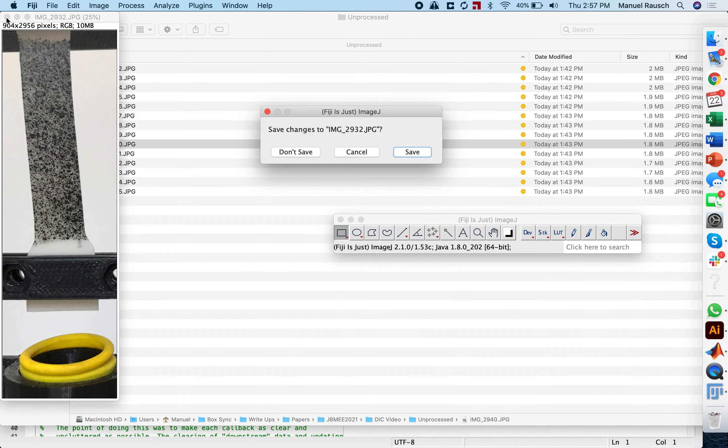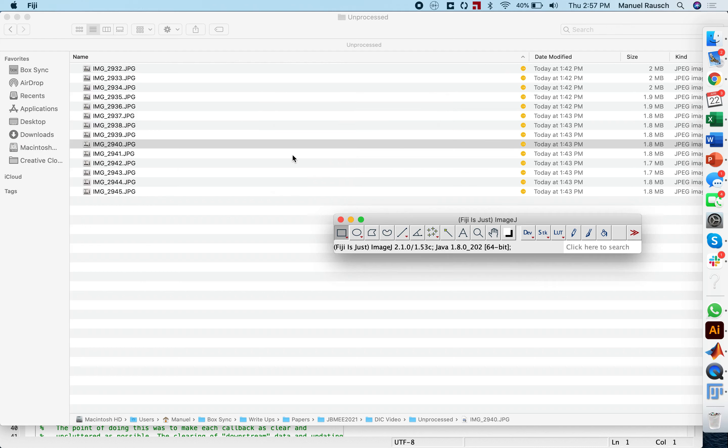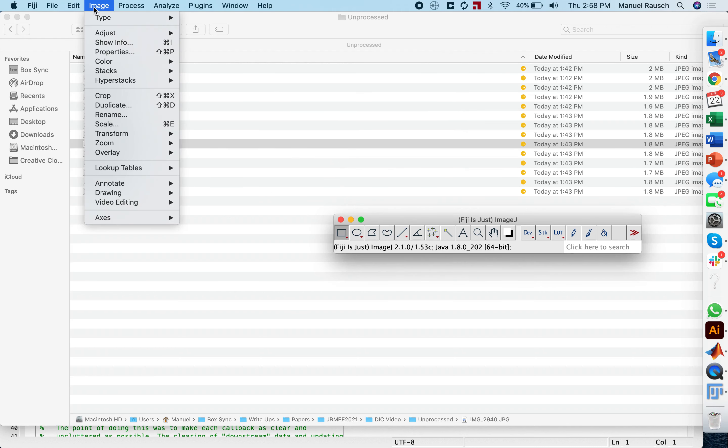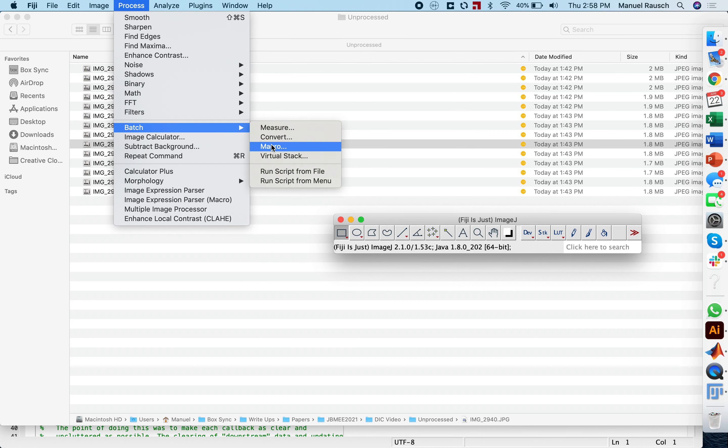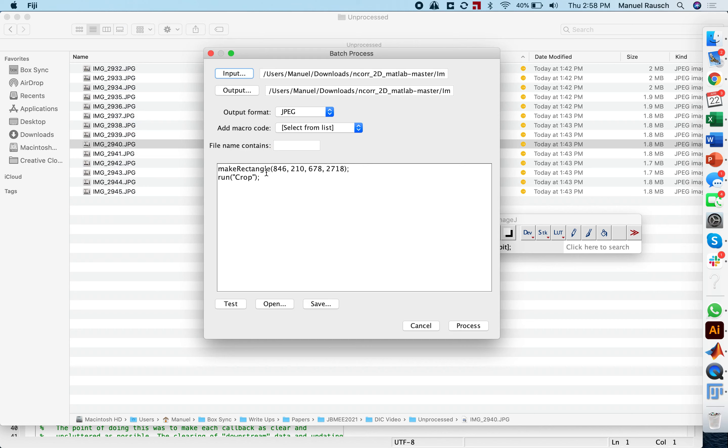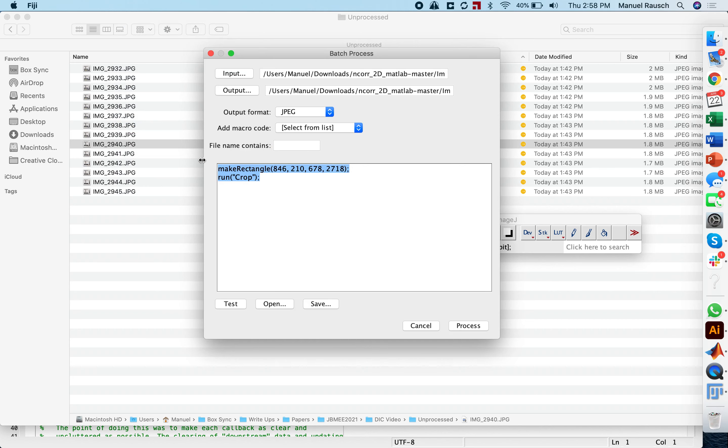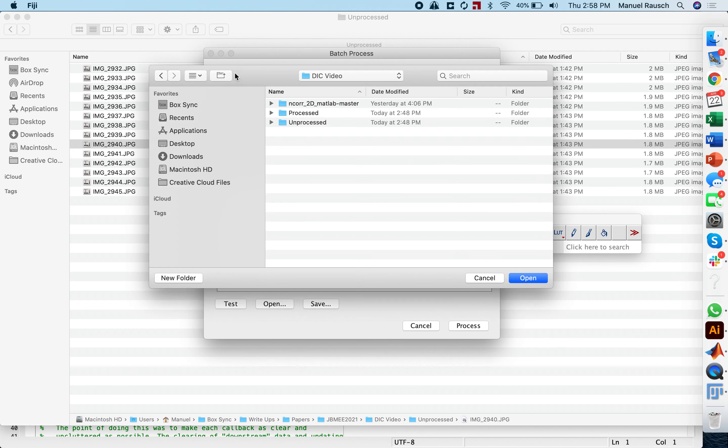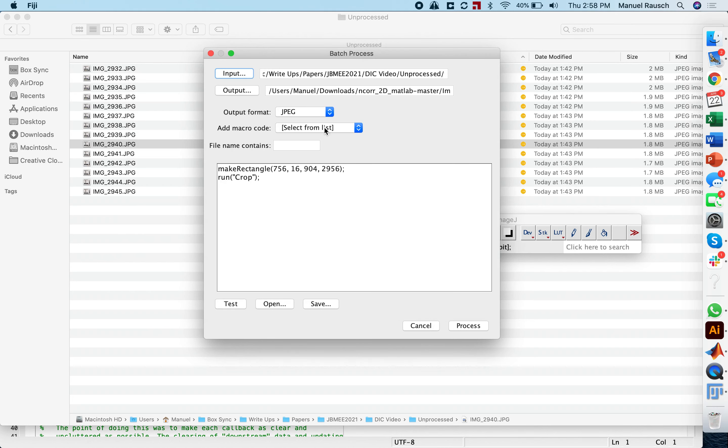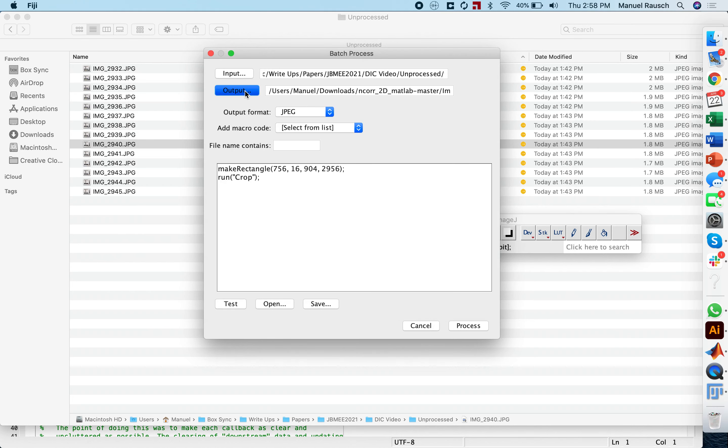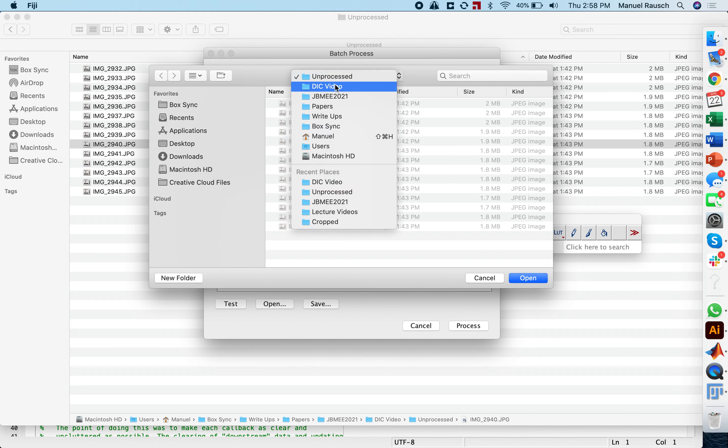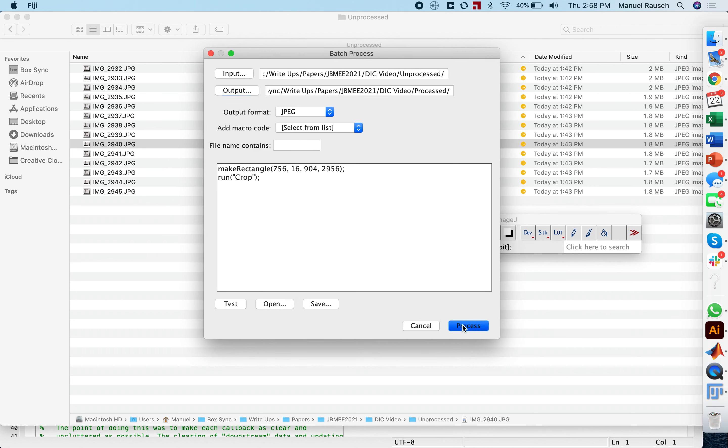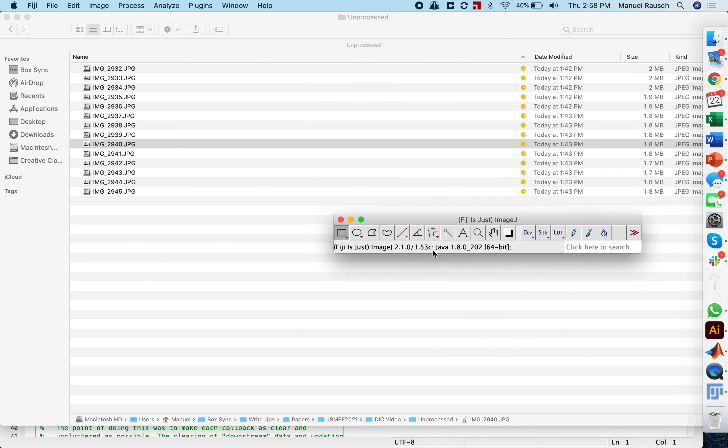I close this. I don't need to save this, but what I will want to do is actually a batch process. The images that I took, I'm going to go under batch and then macro. I ignore whatever's in here, and instead paste in what I just recorded. Here, I'm going to select the unprocessed images as the input, as well as the processed images as the output, and I click process.